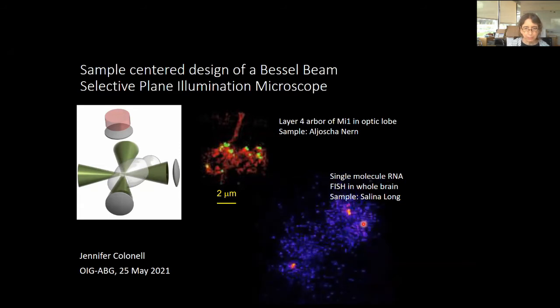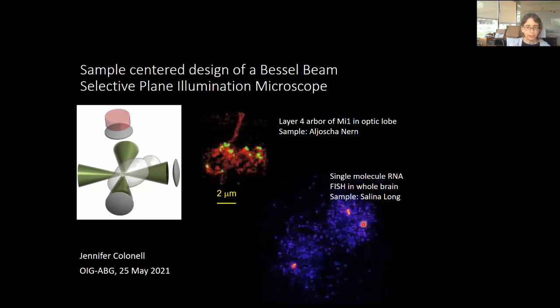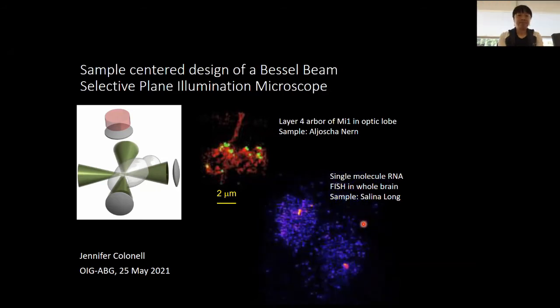Sure. So I'm going to be talking today about a microscope that we built specifically to do high resolution imaging of whole mount Drosophila brains, so whole fruit fly brains.